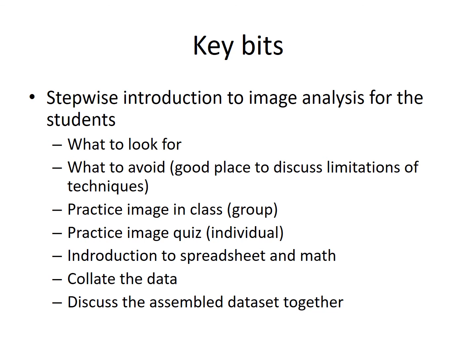I then gave them a very step-by-step introduction to the spreadsheet and the math, and a step-by-step introduction on how to use the software. Then I collated the data myself, but then we spent the time to come back and discuss the assembled data set together.